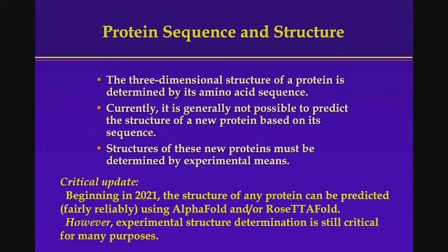Does that mean that we are out of a job as structural biologists? No. It's, again, only a tool. And I'm an experimentalist. I'll show you one example later. The prediction actually gives you a very good picture of what the protein looks like, but the details may still not be right. So again, you have to get the structure yourself to really prove to yourself that the structure you have is actually what it is.